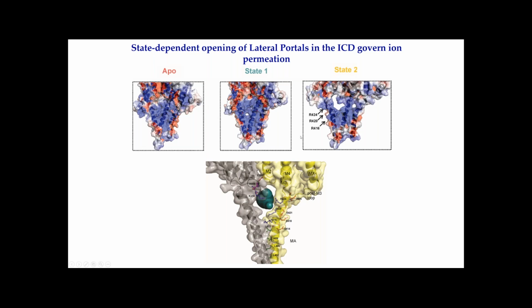Previous studies have shown that these 3 arginines are responsible for the unusually small conductance of 5-HT3A homopentameric channels. And it was suggested that these arginines might be causing an electrostatic repulsion, lowering the conductance of the channel. And in support of this idea, we see that these arginines are actually lining the portal through which ions exit.